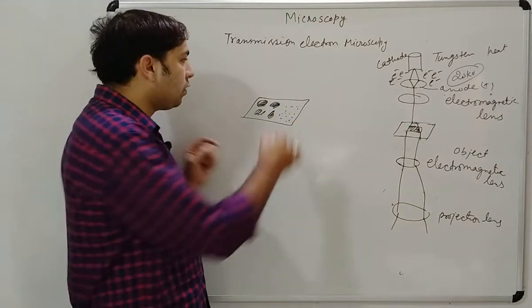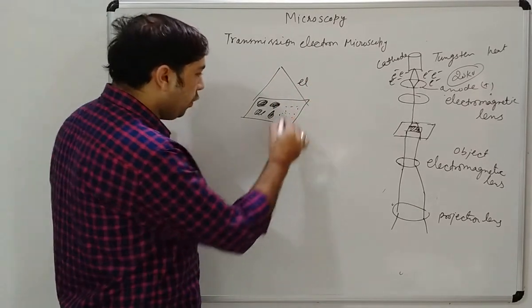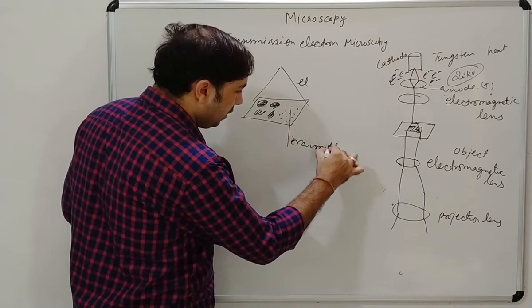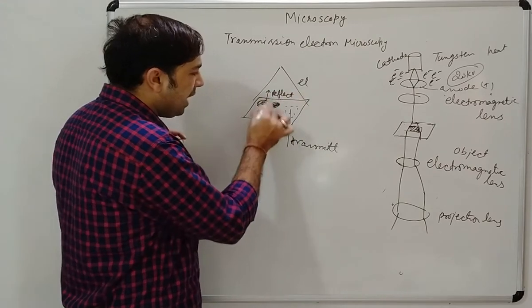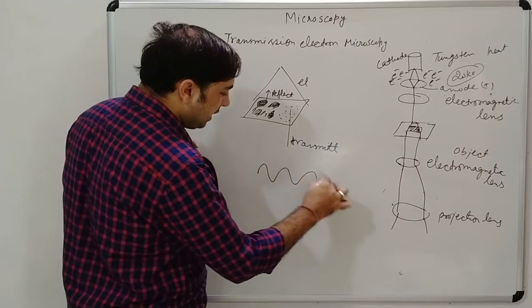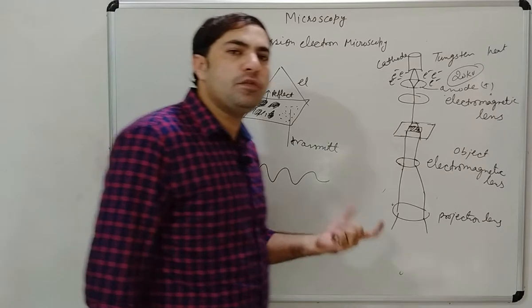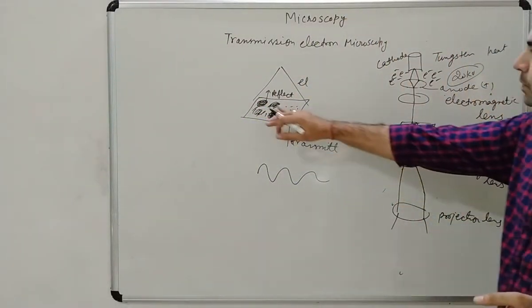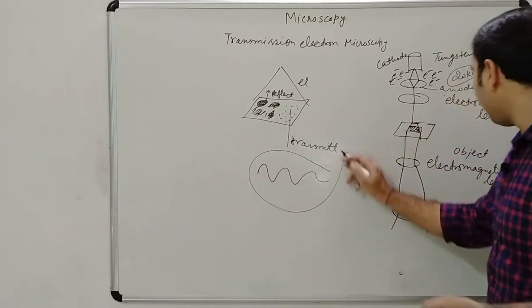When you pass the electron from here, then few electrons are transmitted. Few are reflected by the big size of particles. So now the curve is, we will get some up and down value of the transmission due to the electron, due to this big particle.